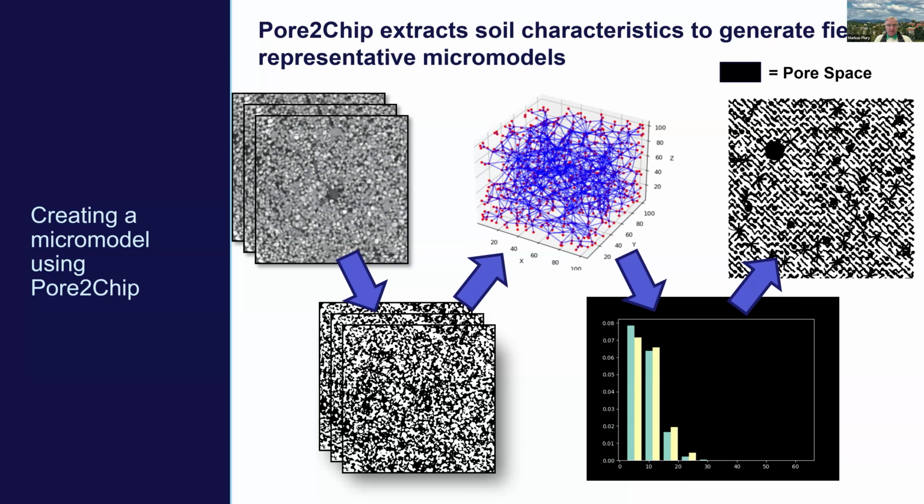And of course, I think that what Charlie mentioned with the validation is really interesting to do, because I guess, Brian, you can run those simulations also in 3D, right? Yeah, I can. So you could actually validate numerically whether the 3D version would match up. Let's say you just calculate the permeability, for instance, or a breakthrough curve of a tracer, and compare the 3D and the 2D and see how well they actually match, right? Yeah, I agree. That's really cool.